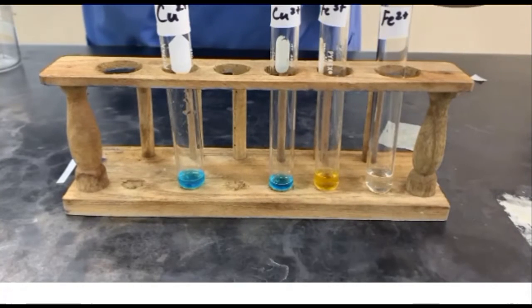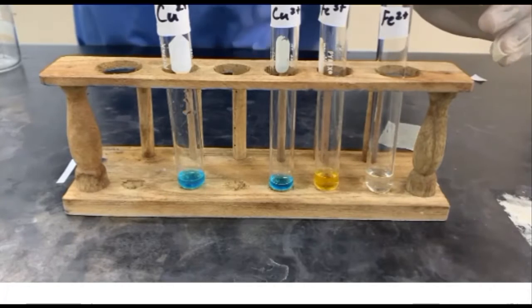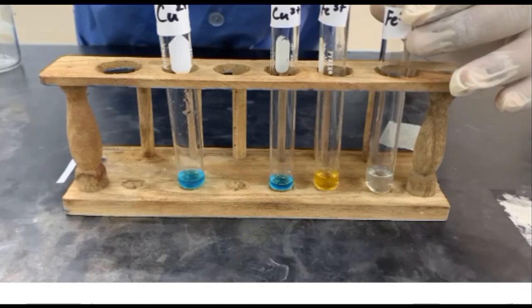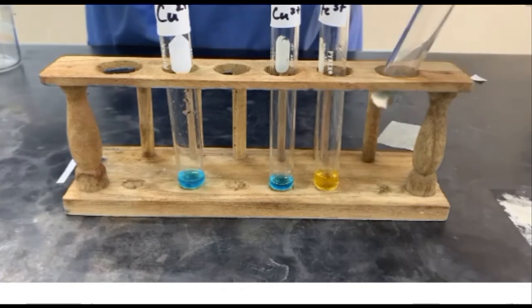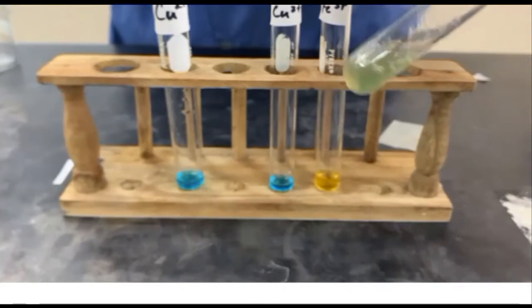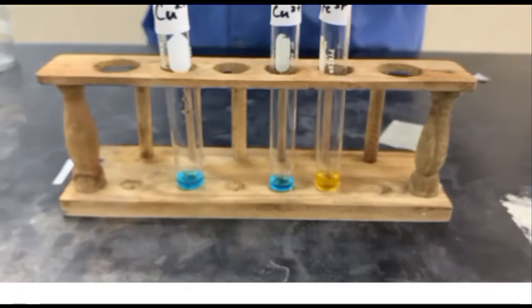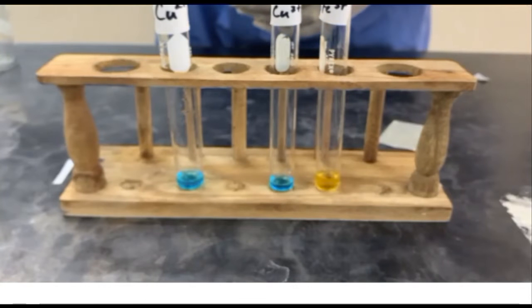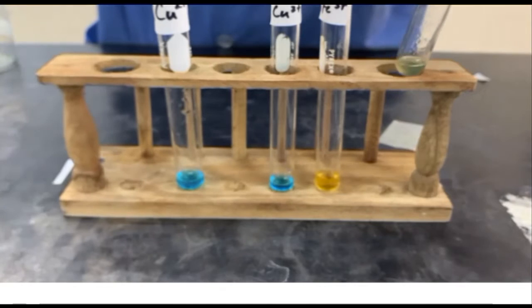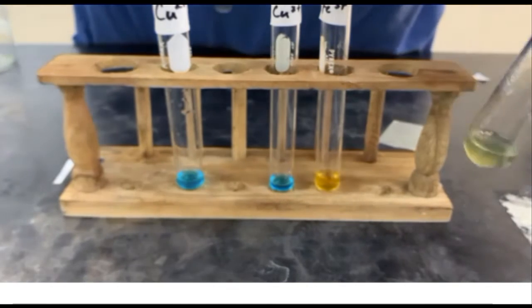So this is the first run. We're going to add a few drops of sodium hydroxide to, and this is our precipitate. We want to pour off most of it. So we add the sodium hydroxide in excess.